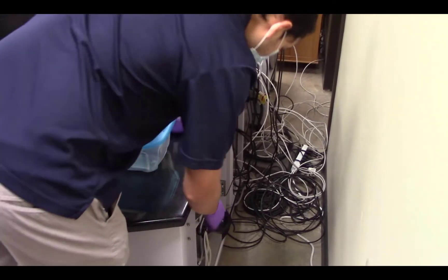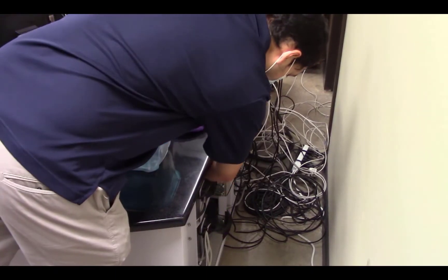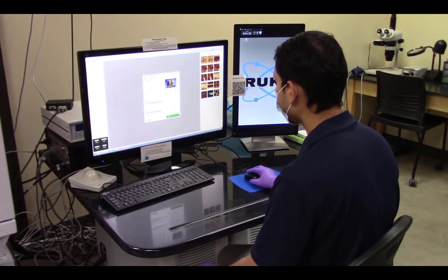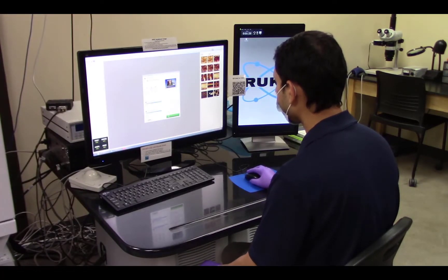Next, turn on both controller boxes located behind the table. Finally, launch the Nanoscope software.